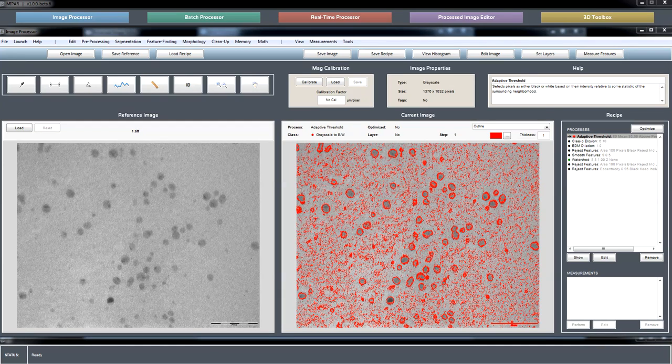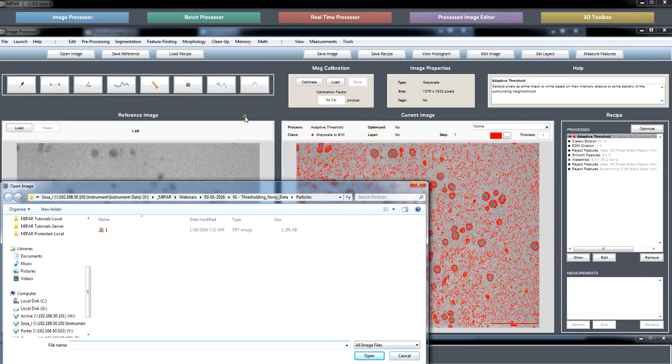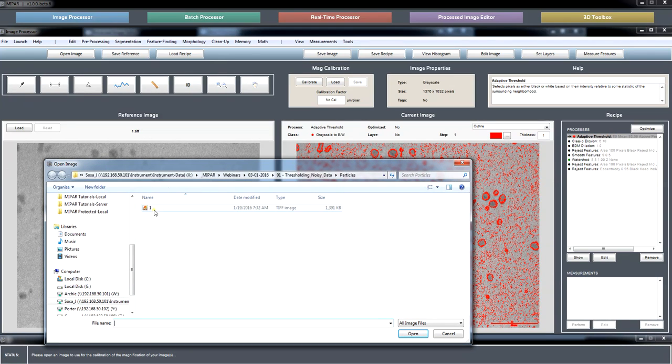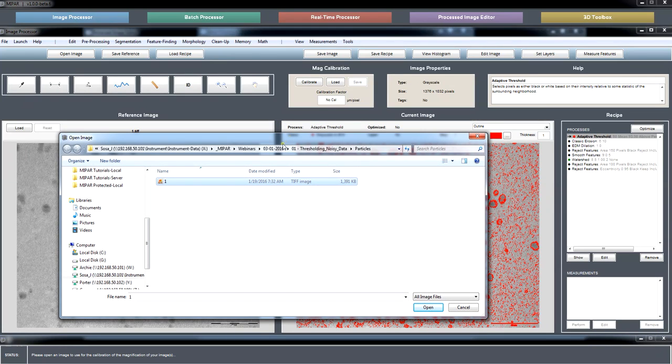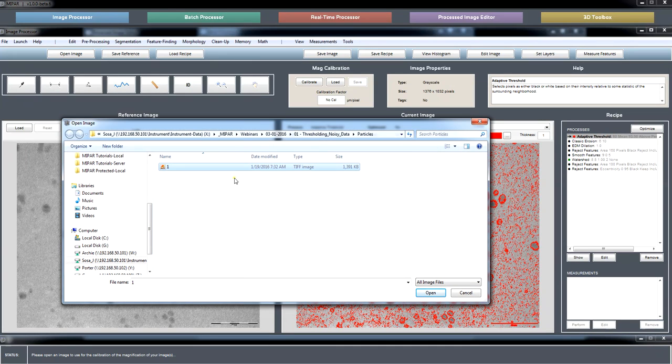Usually folks have some sort of scale bar on the image coming in, which is how they're able to calibrate their magnification. So if you wanted to measure these features in microns instead of pixels, this image happens to have a scale bar. A lot of times people end up cropping them off and then processing them. So yes, being able to put them right back on, or add scale bars to images that didn't have nice ones off the microscope, would be good to have available. So I'll work on incorporating that.